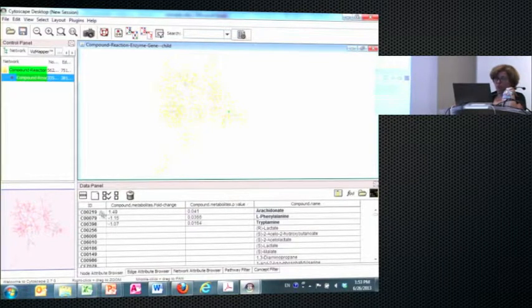And all kinds of information that you see, if I want to, I can just copy and paste that into an Excel or any kind of file or any other application that I want. Okay, that's how you can quickly get to the experimental data, and see what these values actually are.